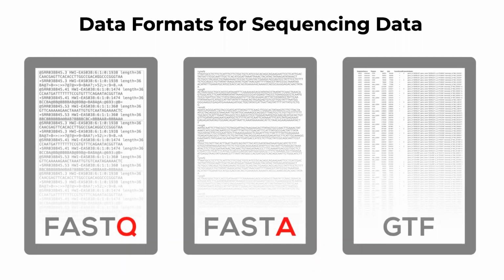Excellent. Okay, what is in the GTF file? Who remembers what's in the GTF file? What information does it contain? Okay, excellent. Annotation and specific annotation about genomic elements. For example, genes, exons, transcripts. Where do they begin? Where do they end?